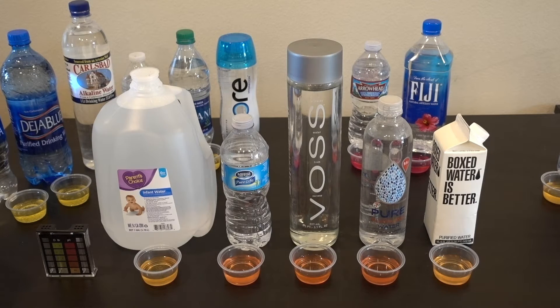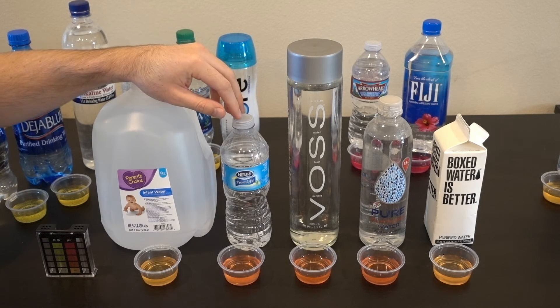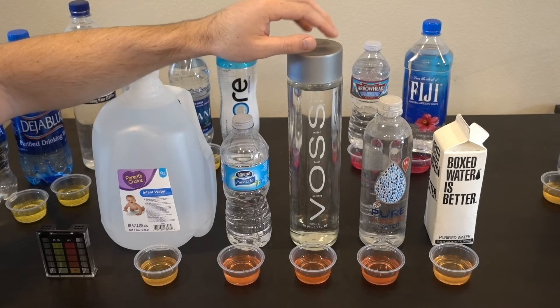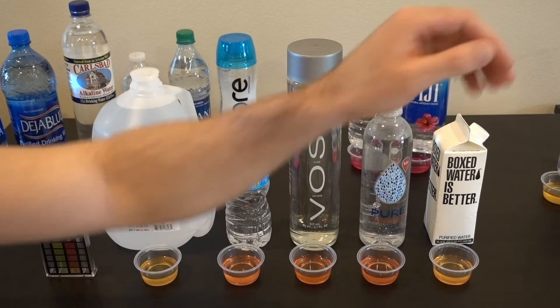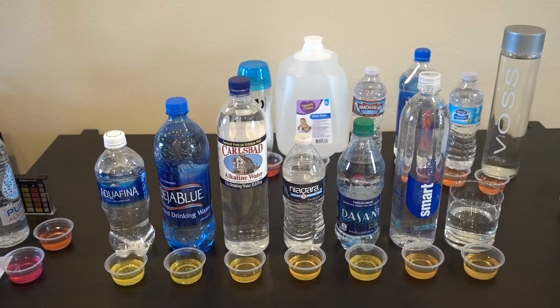Next up are the five waters that turned out to be neutral. The first is water geared towards infants, costing 99 cents a gallon. The second is Nestlé, which is in a lower price range. The third is Voss, one of the more popular and pricey waters. The fourth is a 7-Eleven water advertised as having a pH of nine and a half or higher — that turned out to be false, actually around seven and a half. The last is Boxed Water, which also came out neutral.